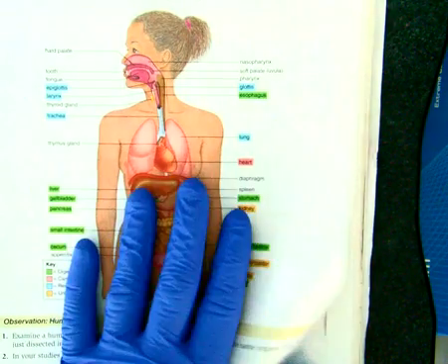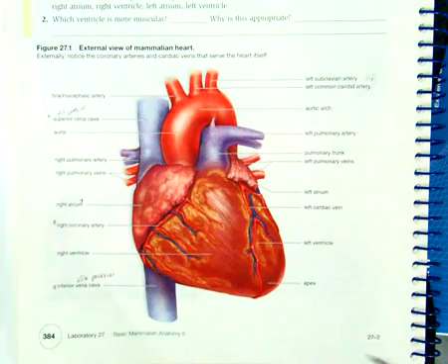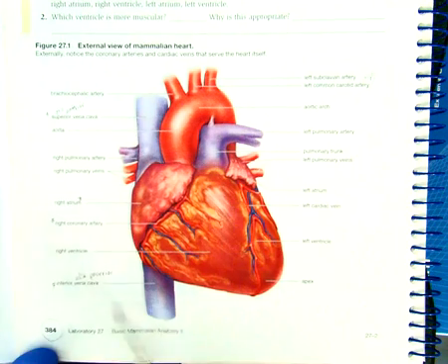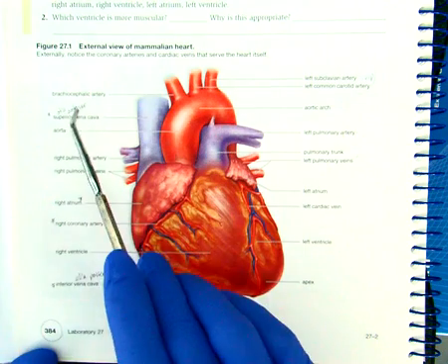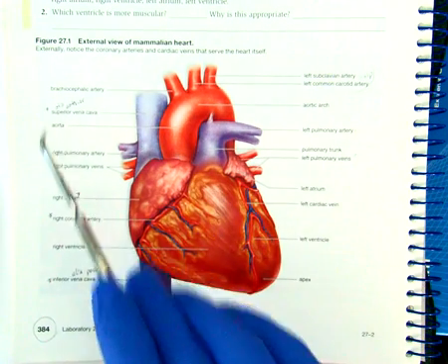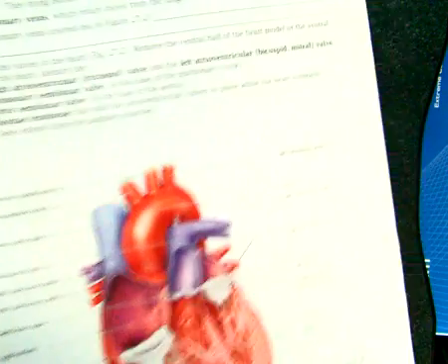All right, and then we skip ahead into exercise 27, which continues the basic mammalian dissection. And in this case, we can take a closer look at the heart. The heart is still a fetal heart, so we'll see some of the blood vessels. You should be able to figure out the inferior vena cava that leads into the right atrium, and the superior, which is also called the anterior, because this is a quadruped, and the inferior is called the posterior. So it's a posterior anterior in the pig, it's a superior inferior in us. All right, so we might see some of the major vessels, the aorta might be very evident, and maybe the pulmonary artery.